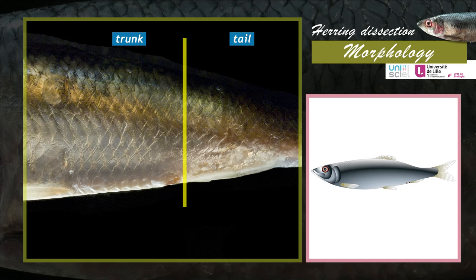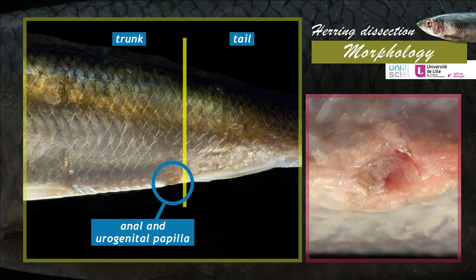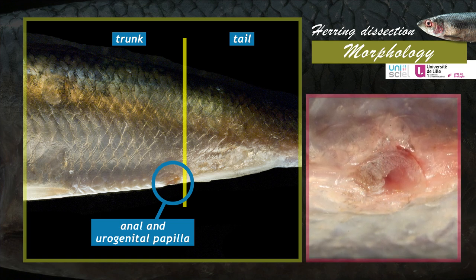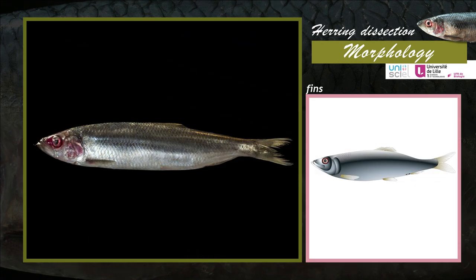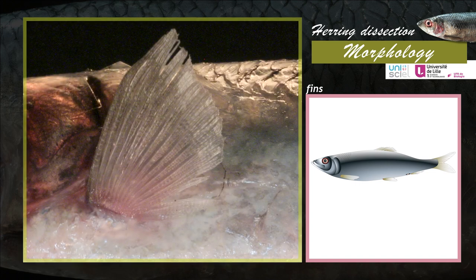Pigments and crystals are present on each scale and give the animal its colour and metallic sheen. In the terminal part of the trunk, on the ventral position, we can see the anal and urogenital papilla. This is where the digestive, reproductive and excretory systems arrive. The herring has both unpaired and paired fins. They are flexible and held by bony fin rays, the Lepidotrichia.